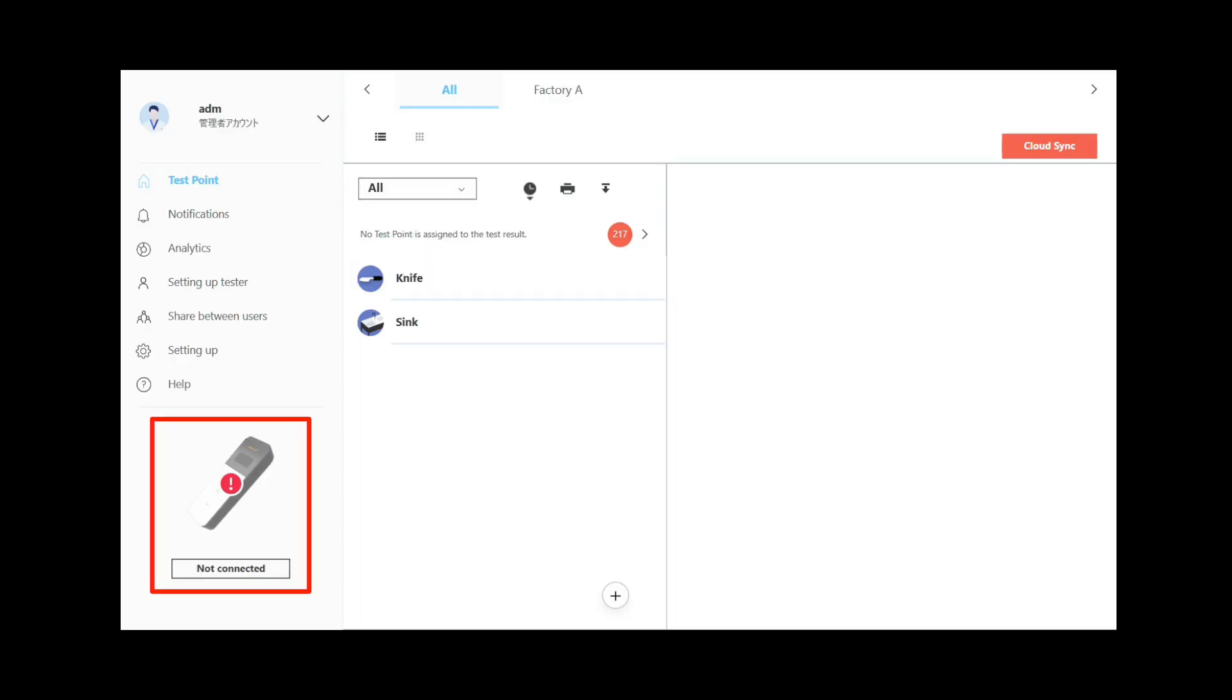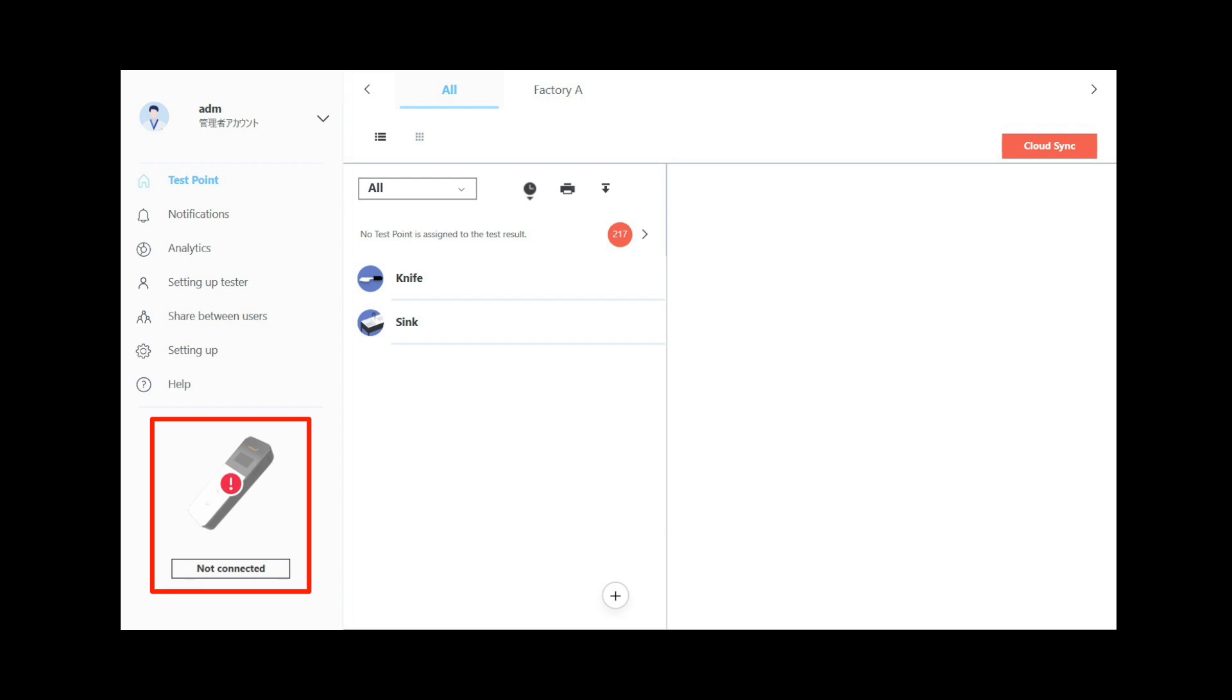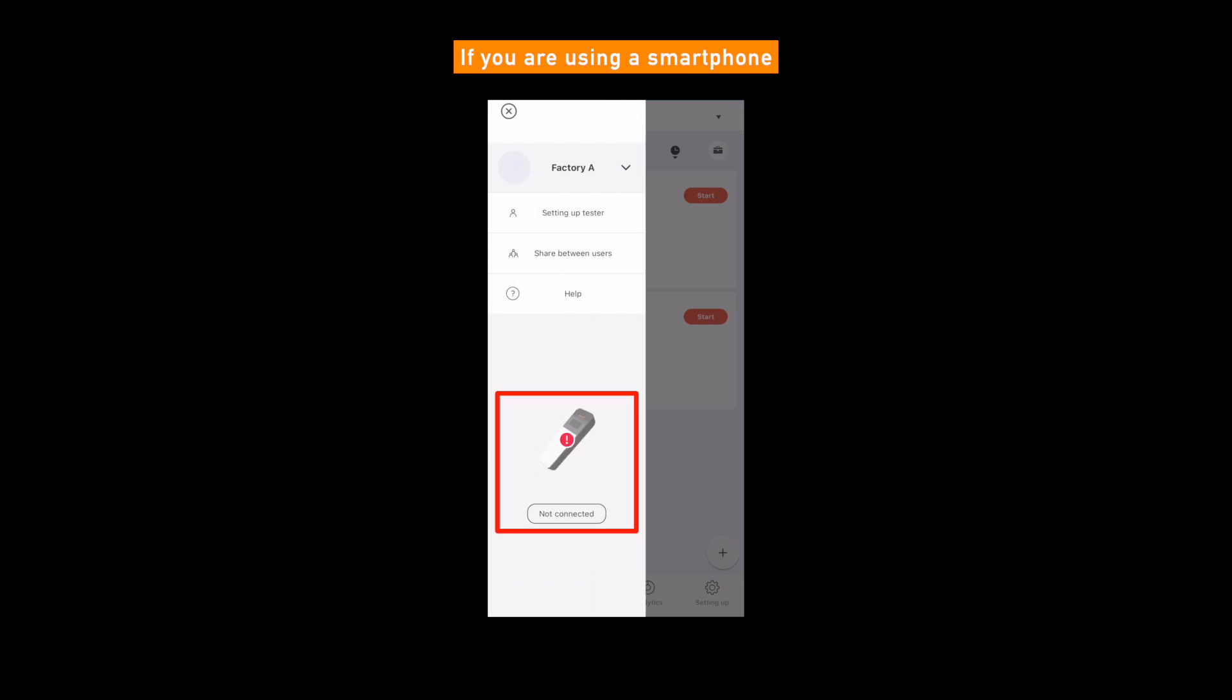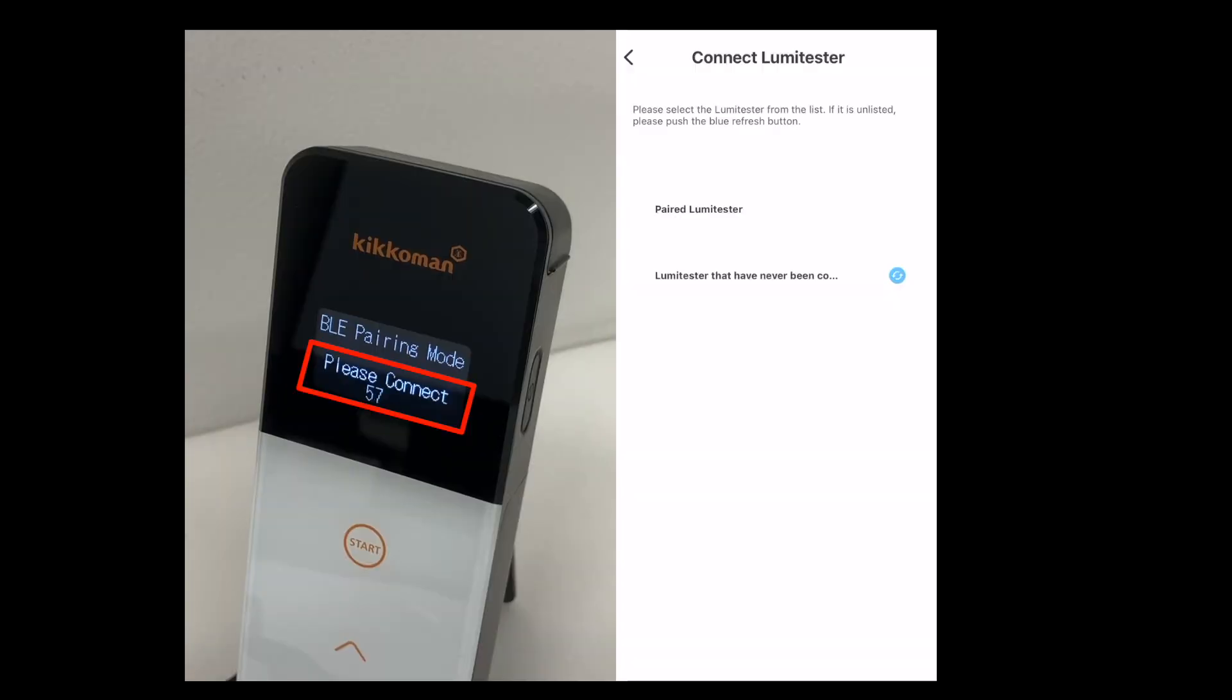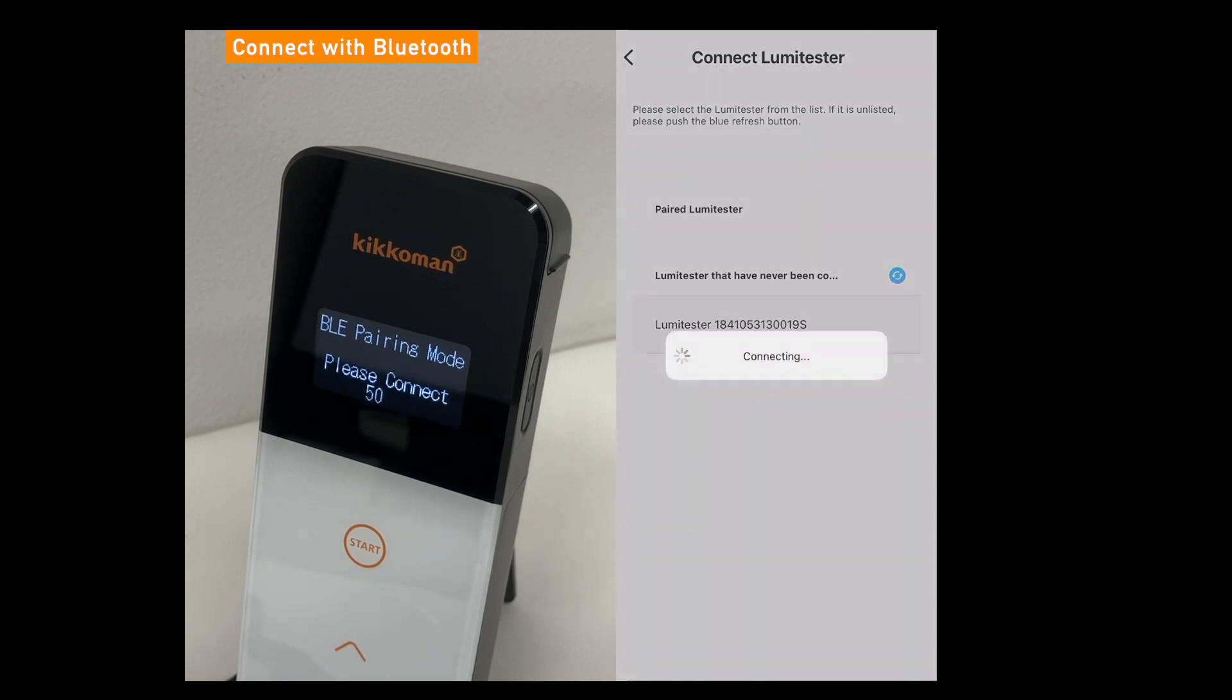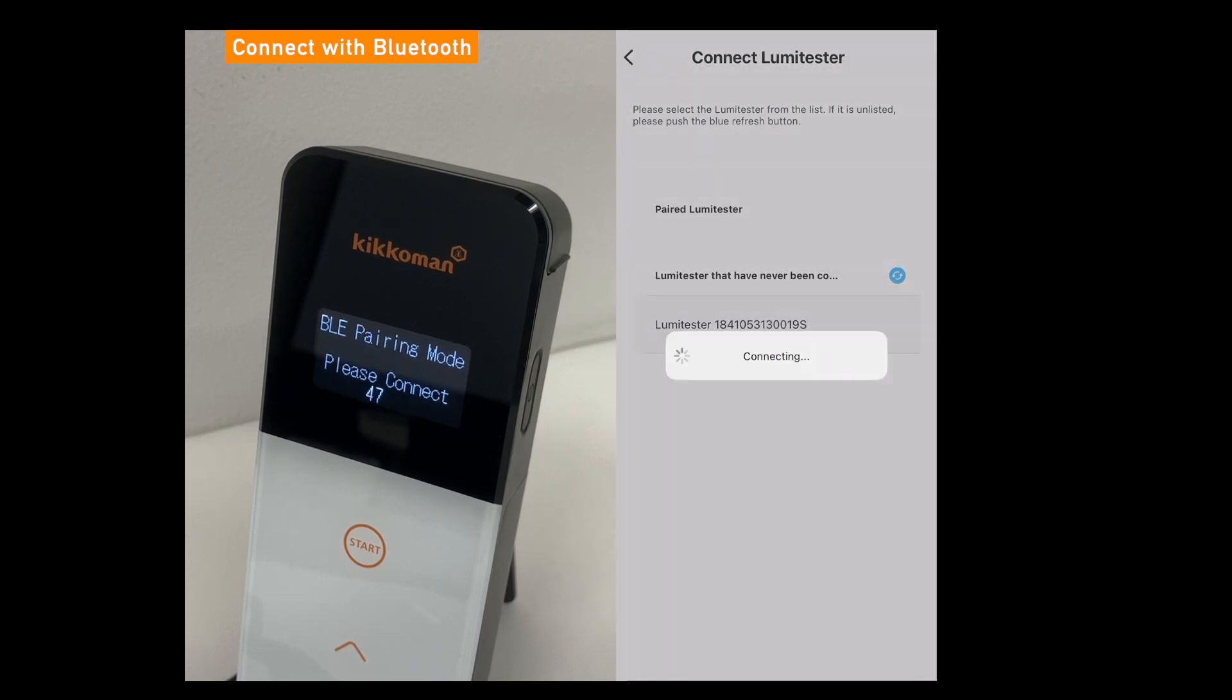If you are using a PC or tablet, click or tap the Lumetester smart icon on the left side of the screen. If you are using a smartphone, tap the menu button in the upper left corner to display the Lumetester smart icon. Next, click or tap the blue symbol on the right of Lumetester that have never been connected, the serial number will be displayed. Select the serial number to complete pairing.